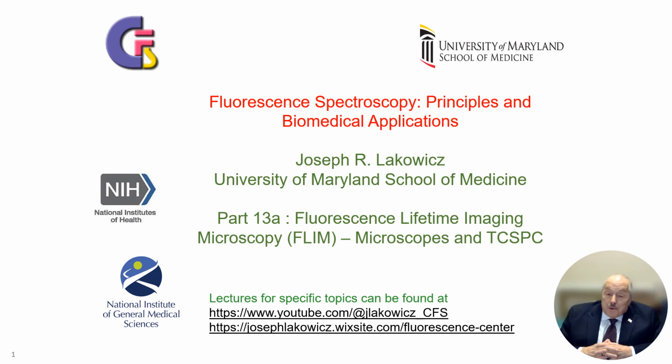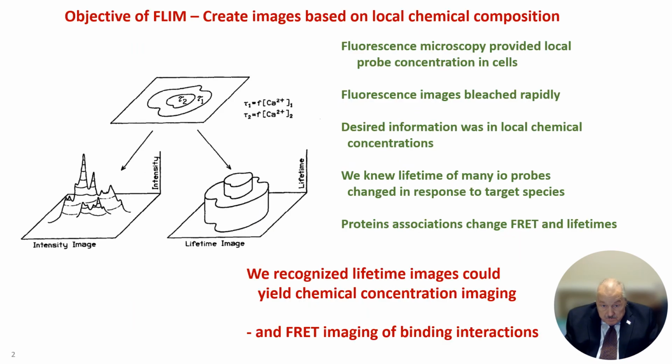This was sort of a miracle when it first came together because it seemed like it'd be something almost impossible to do. But now it's present on many microscopes. Of course, it can be done both in the time domain and the frequency domain. We'll start by discussing the time domain measurements because they're easier to understand.